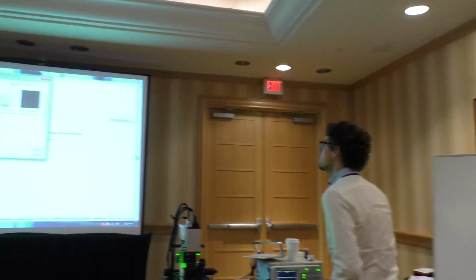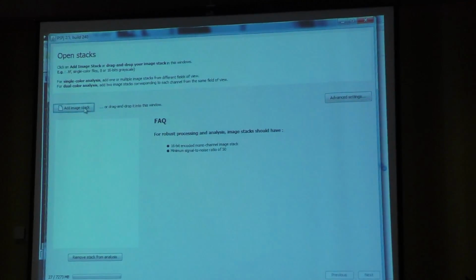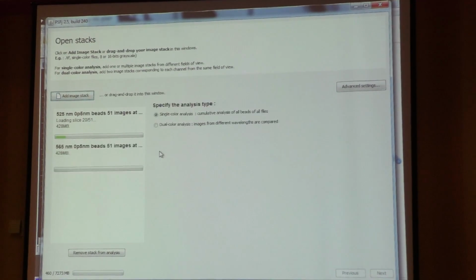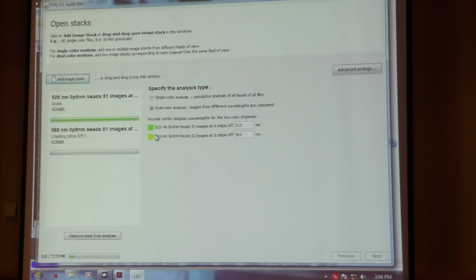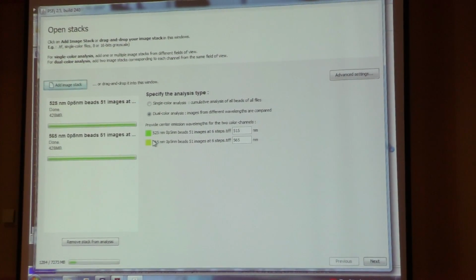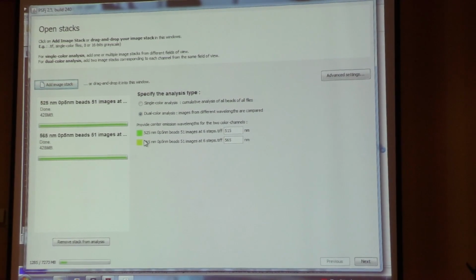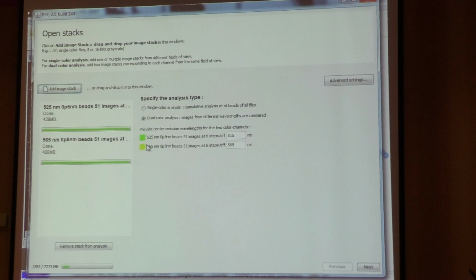program that you see here. It runs in ImageJ, and it's basically an easy way to analyze bead images. And what the consortium is saying is, for some data that have a certain aim, where you want to do a certain measurement, we would like you to add this sort of data and these reports as metadata to your experiment. So all you do is you basically load them. Yeah, you can follow Max along here.